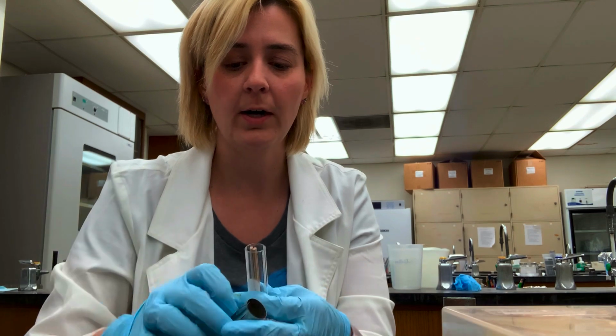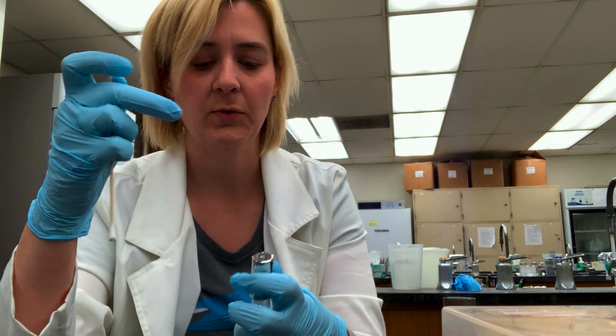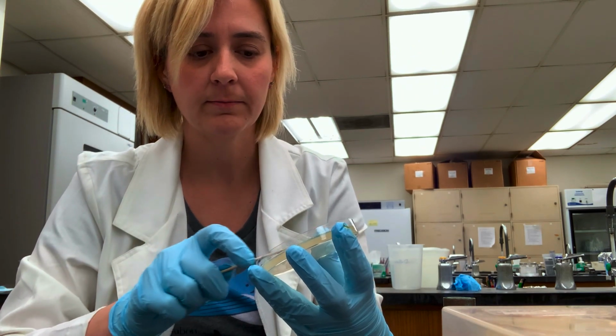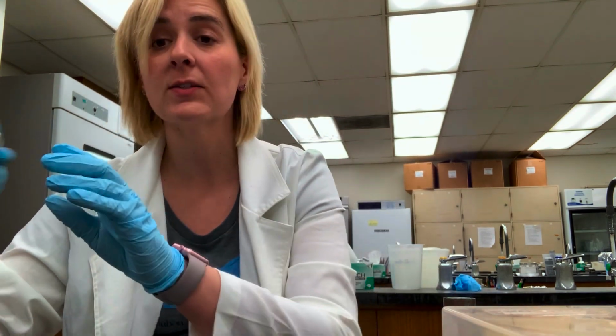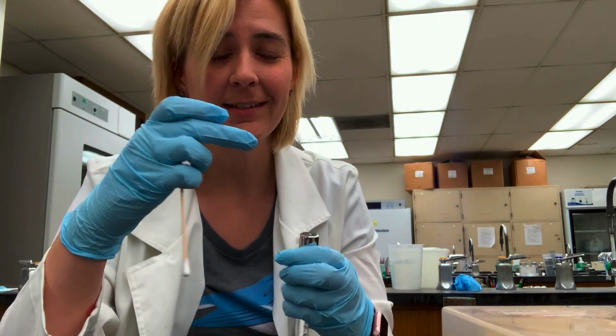So what we do is we take our bacterium, we've got a bacillus isolate, and we'll take a sterile swab. Dip that sterile swab into our bacillus culture, get our swab nice and full of bacillus, and then we will make our lawn. Just to be on the safe side, I am going to use a second swab to really ensure that I have a nice lawn of bacteria so that I can easily see what's going on tomorrow.